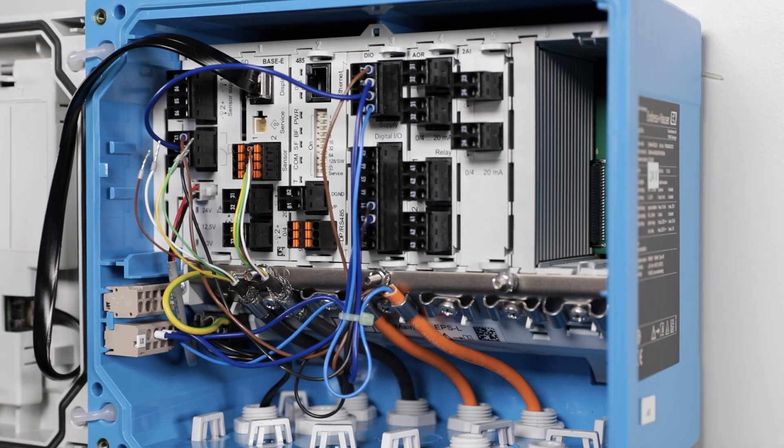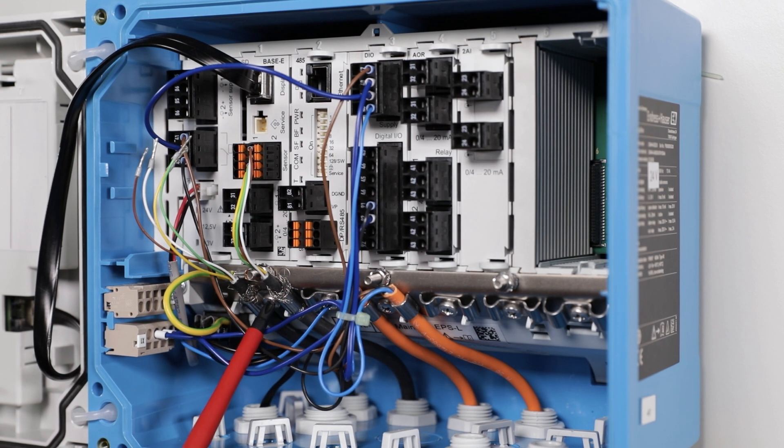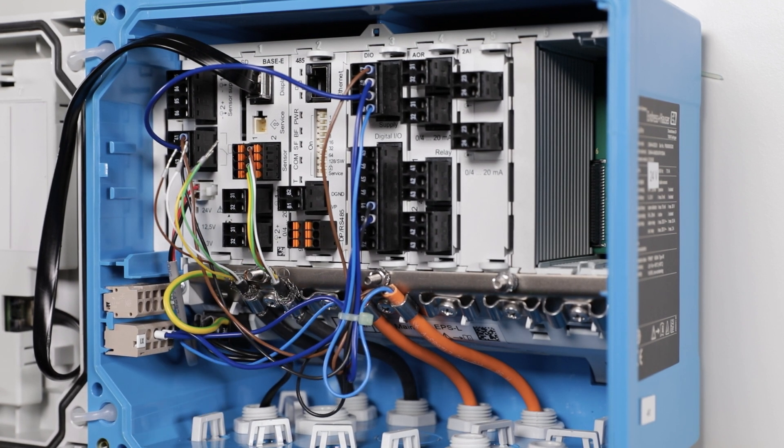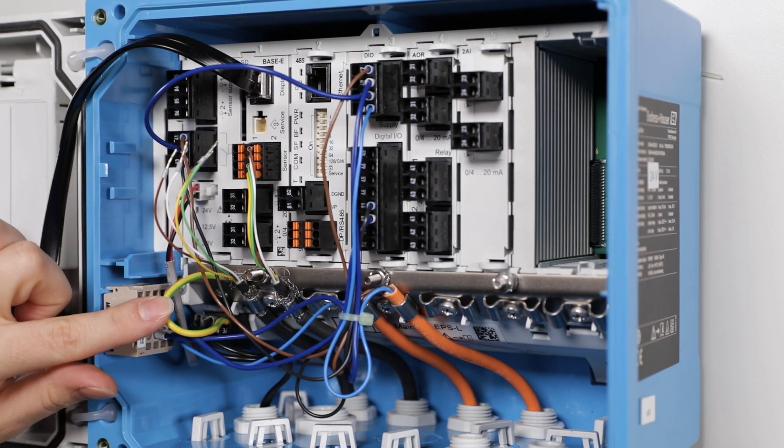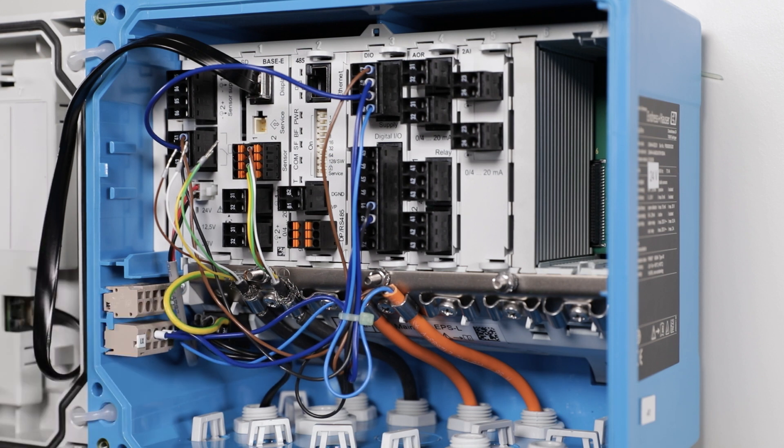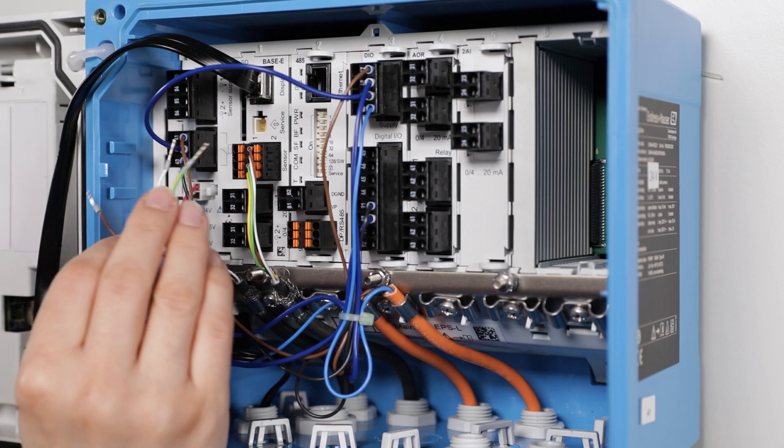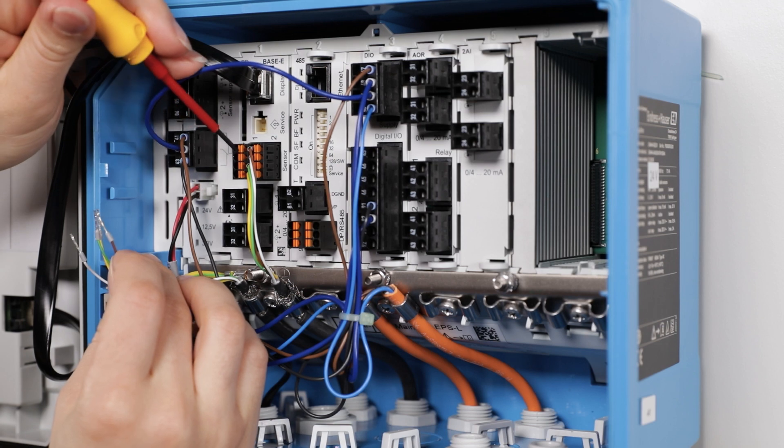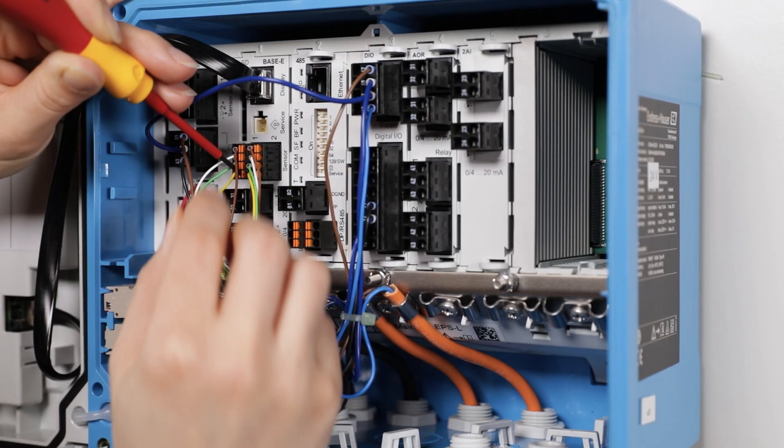Attach the exposed cable shield to the grounding clip by using an appropriate cable clamp. Make sure the cable mounting rail of the CM44 is properly grounded. Thanks to the color-coded wires the connection is very easy.